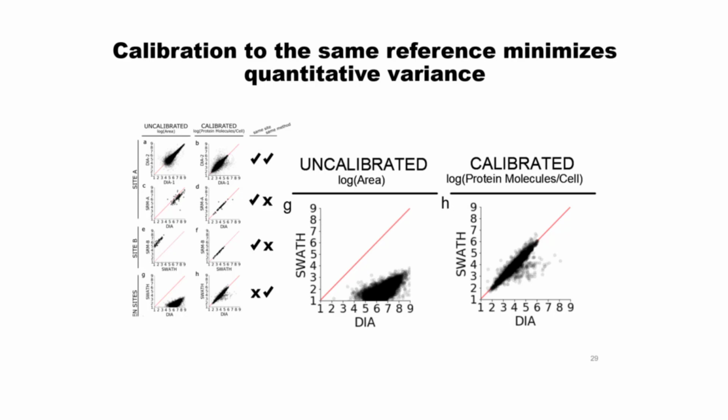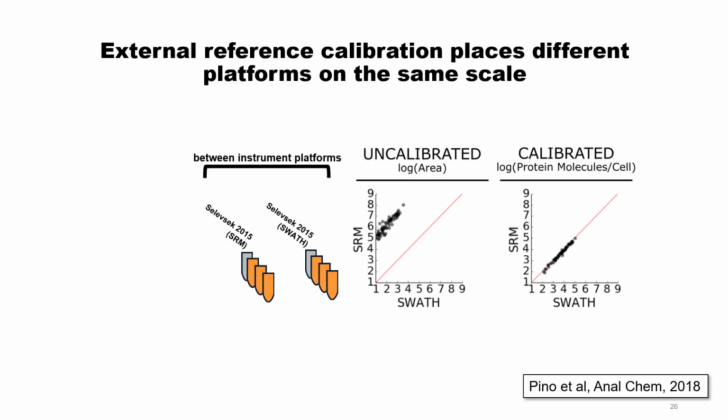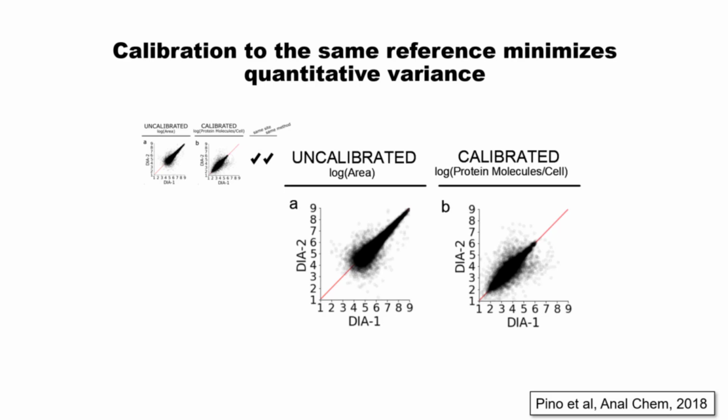Yeah. So, looking at that first level plot, one of your 4 plots over there, I think I can explain why the shape changes. Lower signals have worse relative precision in general. But when you calibrate things to copies per cell, the lower signals may not necessarily be the lower copies per cell. That's my explanation for it. So you've moved some of your worst precise things up, and you've moved some of your better precise things down. Yeah, so there may be things with lots of copies per cell that just don't have it. That's right.